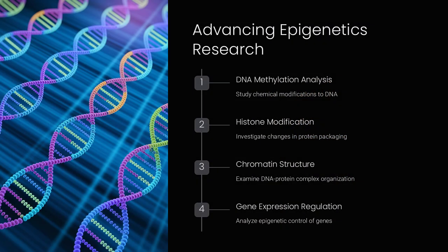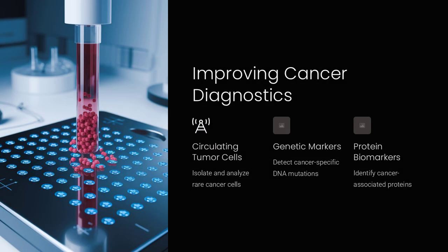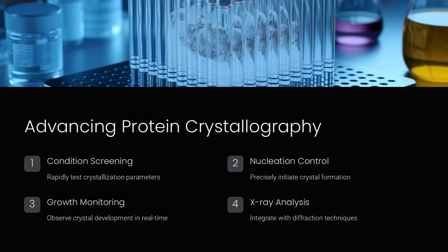This not only speeds up the workflow, but also reduces the potential for error and contamination, which is especially critical in sensitive diagnostic and research applications. The versatility of reconfigurable droplet platforms is further enhanced by their programmability. Scientists can design and execute complex protocols by simply reconfiguring the electrode patterns and controlling the timing and voltage applied to each droplet. This means that a single digital microfluidic device can be repurposed for a variety of assays, ranging from DNA amplification and sequencing to chemical synthesis and drug screening.